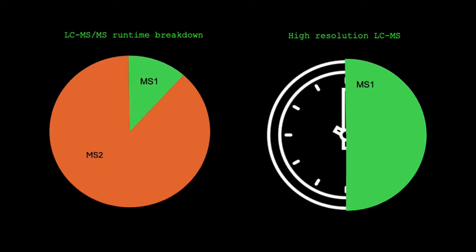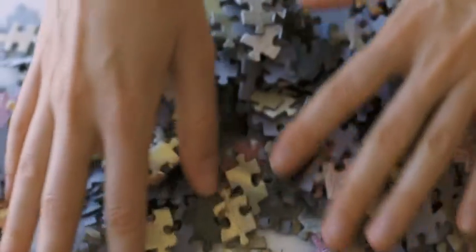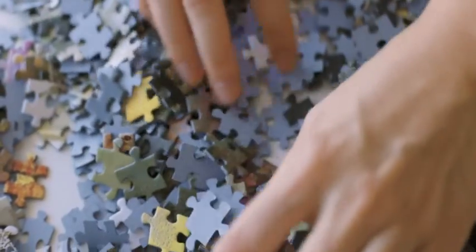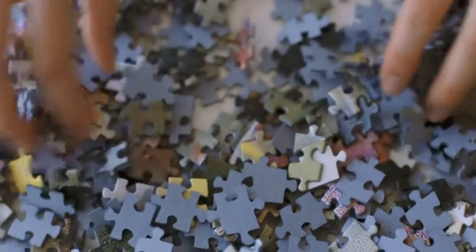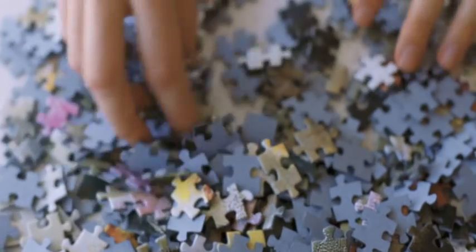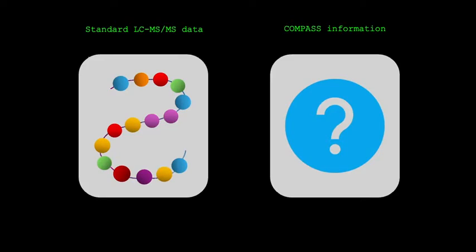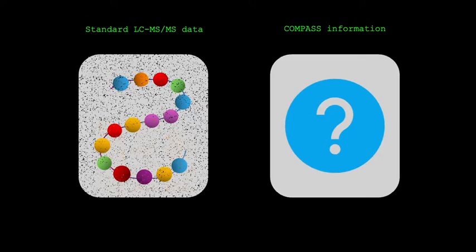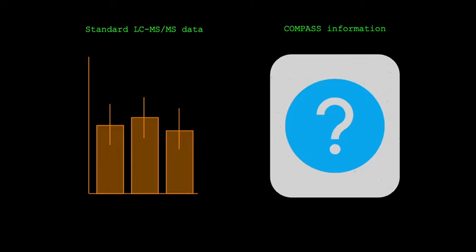A key difference when using Compass relates to the molecular identity of the data points being assessed. The sacrifice of data scale when performing MS2 scanning means investigators know the molecular identity of the data points they work with, though there is no guarantee the specific proteins identified during MS2 scanning have any connection to the biology under study.